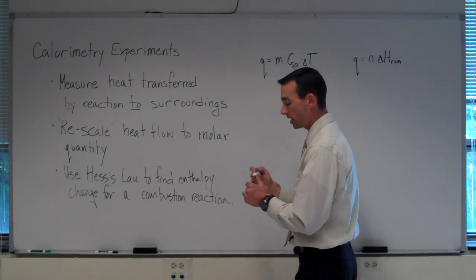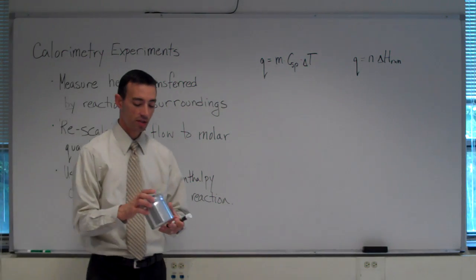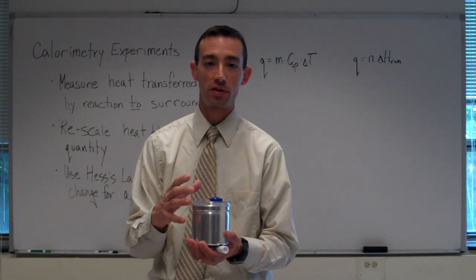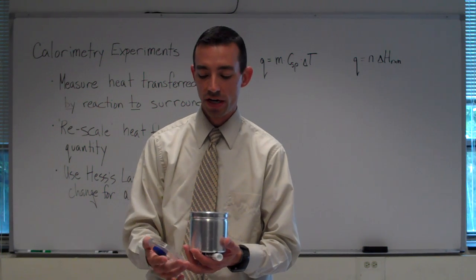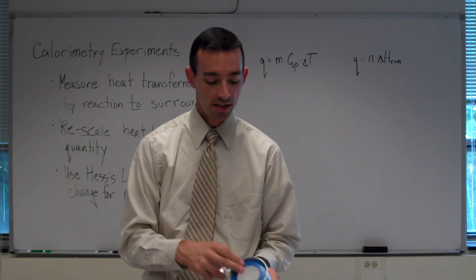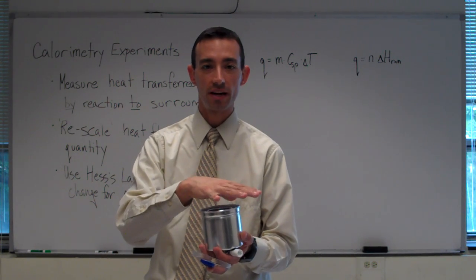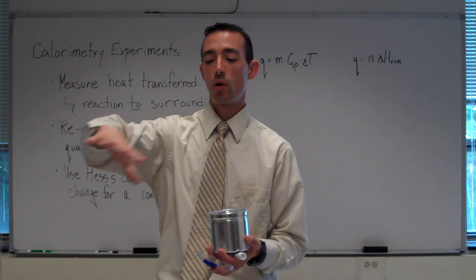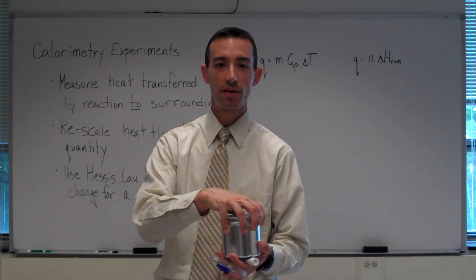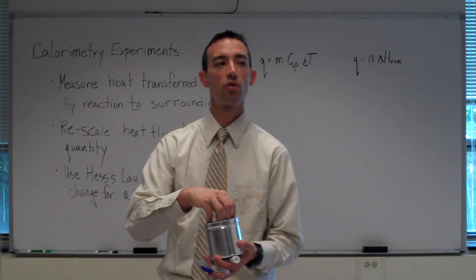We'll set this reaction up inside a calorimeter. So our calorimeter, which is this little device that I have in my hands now, becomes its own little self-contained universe. Inside the calorimeter is simply another cup and then some insulation, which keeps whatever's happening in the calorimeter isolated from an energy perspective. And all of the energy outside of this in the lab is not able to interact with the contents of the calorimeter. So this becomes its own little universe.